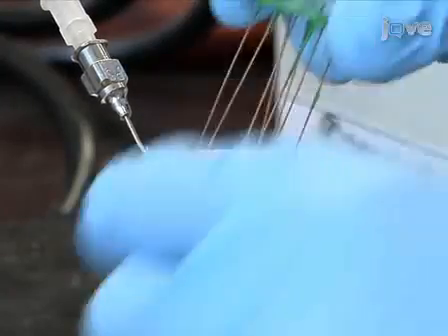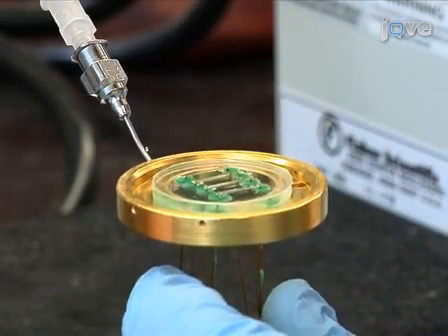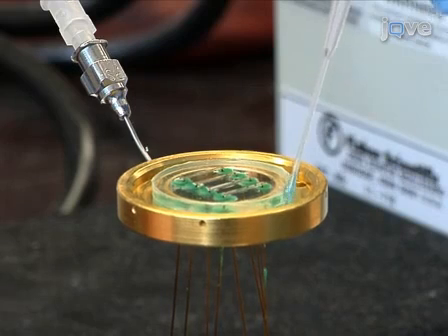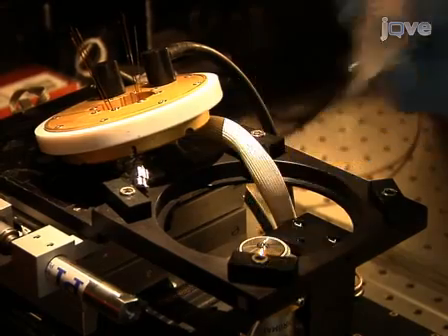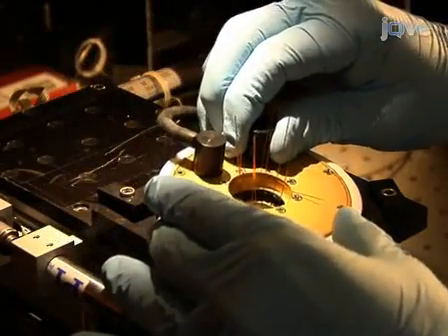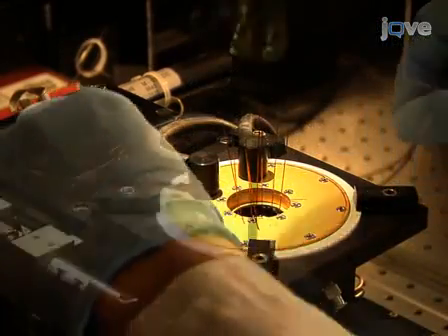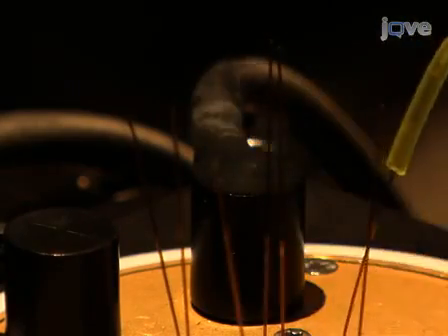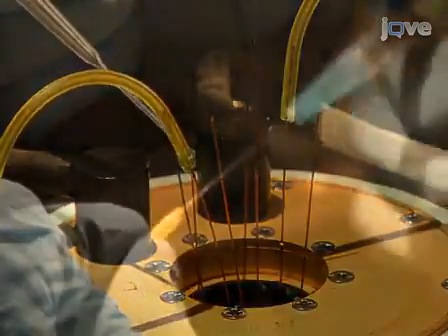After the assembled microfluidic cell has cured overnight, it is placed in a custom-made holder and mounted on the stage of the confocal microscope. To begin activating the surface of the cell for molecule immobilization, connect flexible tubing to the capillaries of the cell to facilitate buffer injection using a syringe and a needle.